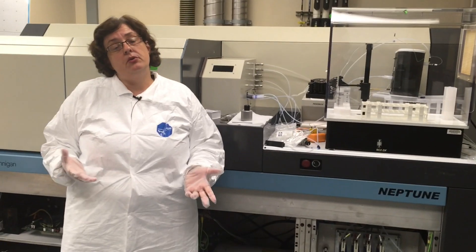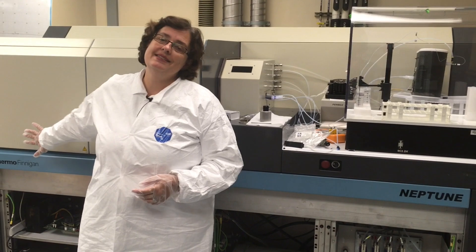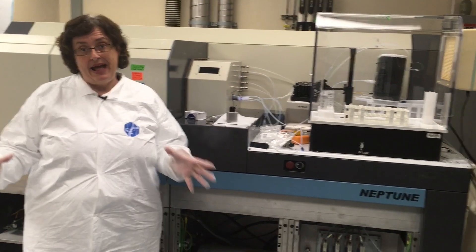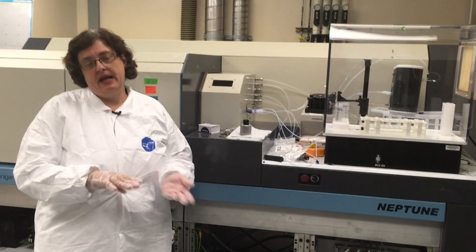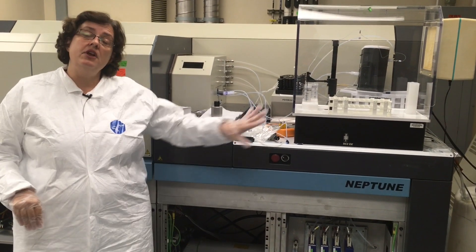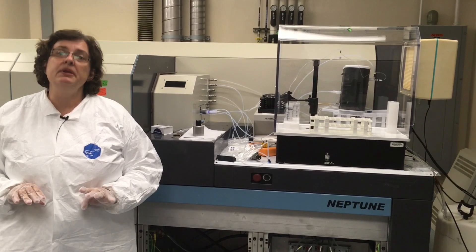The real difference from the quadrupole is in the detector. This is a magnetic sector instrument, so it has a very large magnet which separates the ion beams by mass and spreads them out. We then have nine detectors at the other end, so we can detect nine ion beams simultaneously.